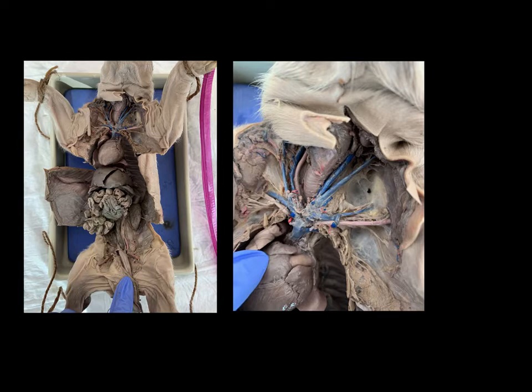The first fetal pig, what we're going to need to learn are many of the larger blood vessels. On each slide that we look at, over here I've got a full image of the dissected pig, and then I'm going to have a more zoomed in area for the region that we're talking about, because it can be kind of difficult to see what we're needing to look at in this full image. But I will orient you for each of the images that we're looking at.